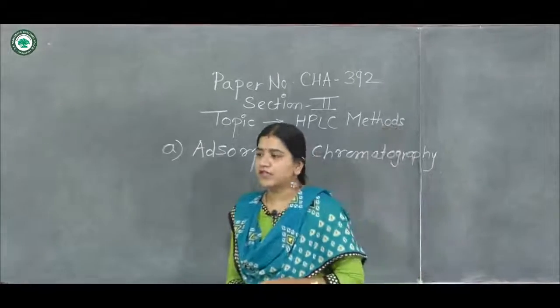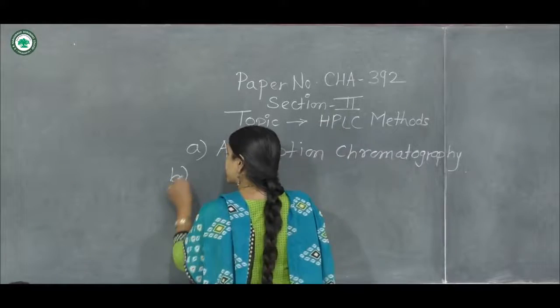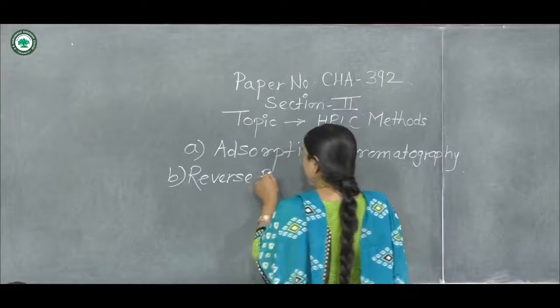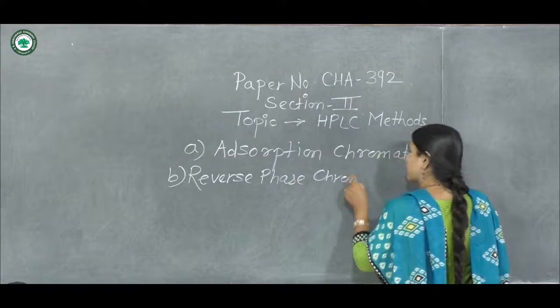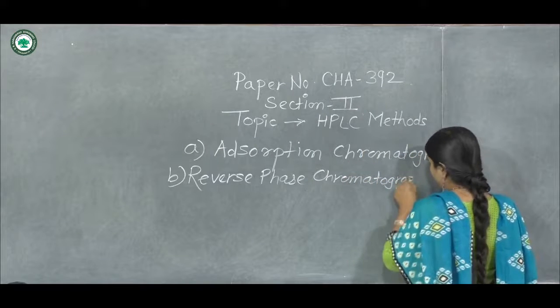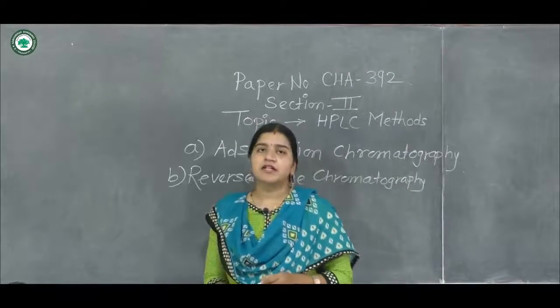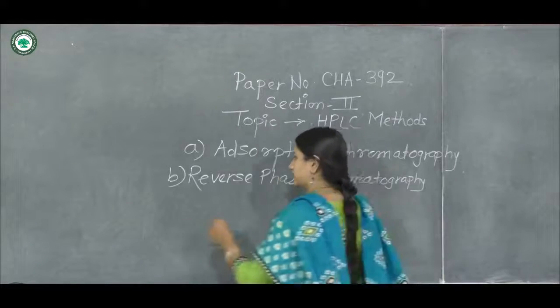The second one is reverse phase chromatography. The third one is chromatography with chemically bonded phase.